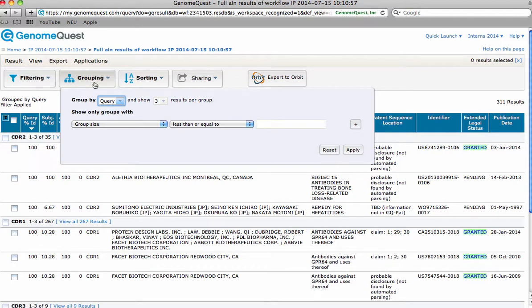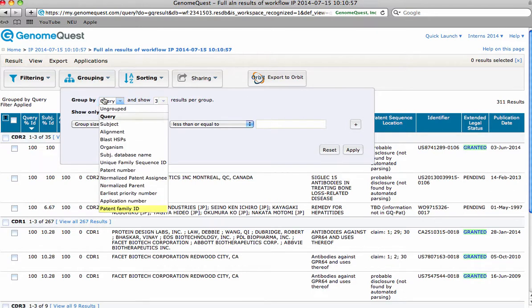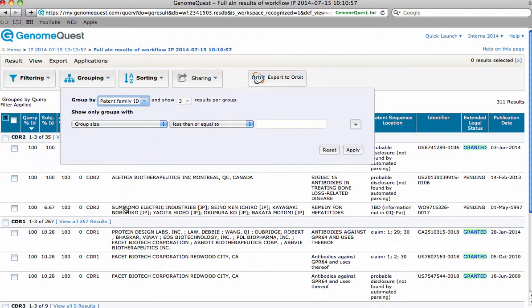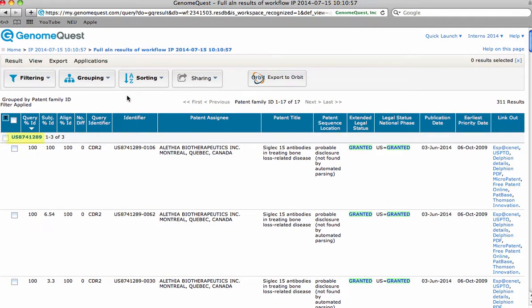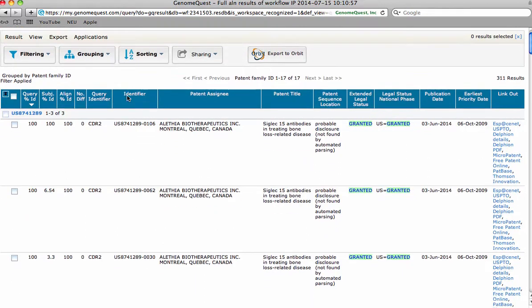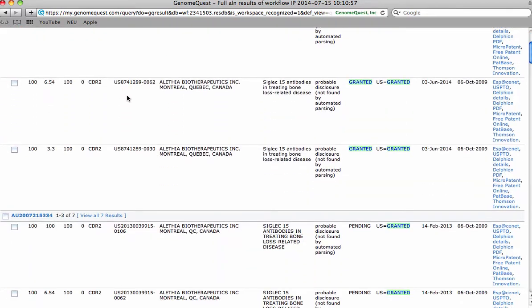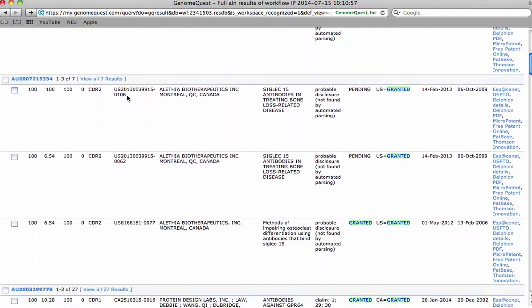When we group by patent family, a clear list should be compiled of which sequences fall under which patent families. Here we can see the specific patent families and the CDRs that fall under them.